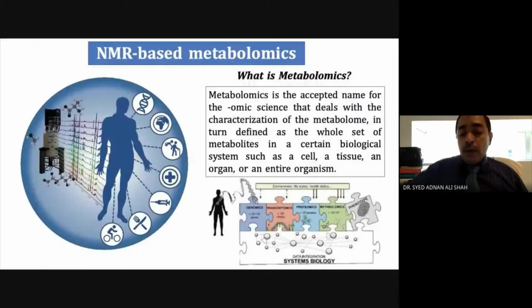Now I will enter into the second part, which is a very demanding topic in the field of science. This is metabolomics, the study of the set of metabolites, or metabolome, the characterization of the set of metabolites, which is called the metabolome. This instrument can easily give the information about the set of metabolome, which is called metabolomics. So I will talk a little bit about NMR based metabolomics.